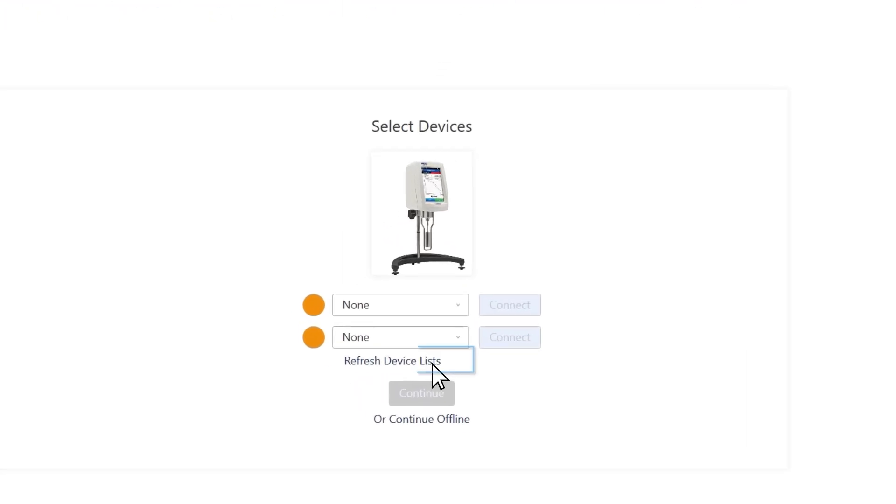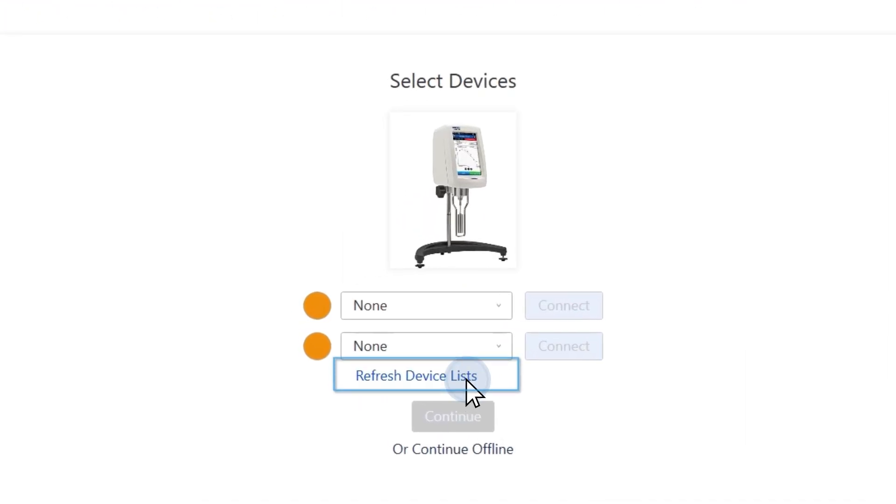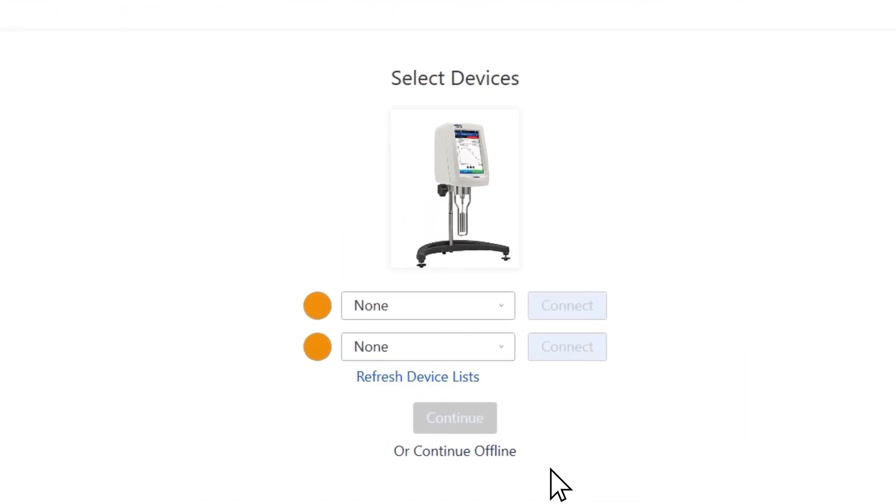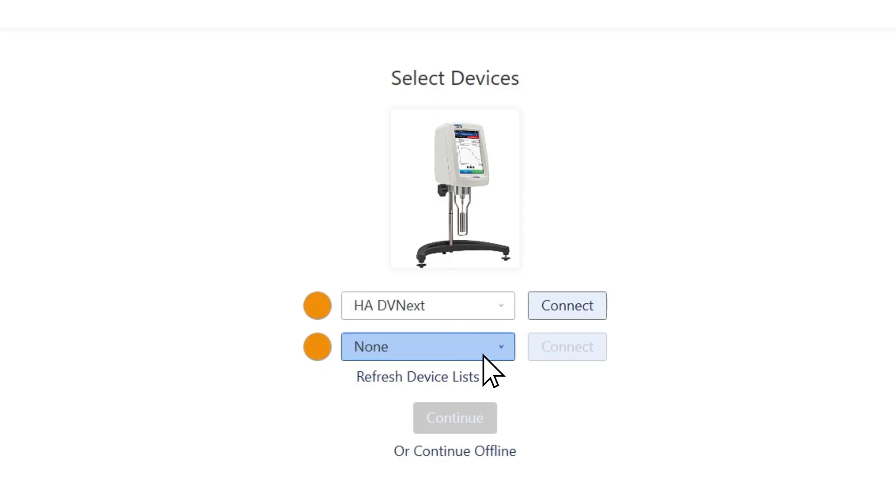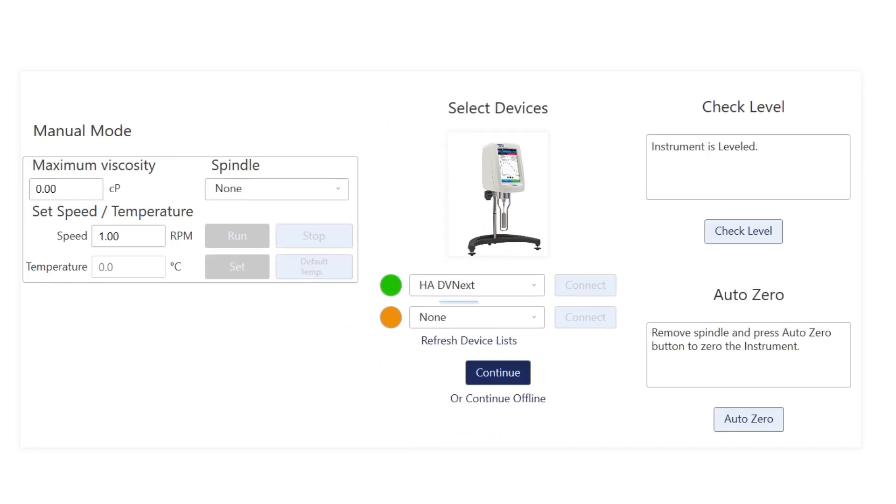In DV360, press Refresh Device List. Give it a few seconds to connect and then click on the drop-down menu. There you can see we've got our HADVNEXT Viscometer for measuring high viscosity. Press the Connect button and the green light comes up, indicating a successful connection.